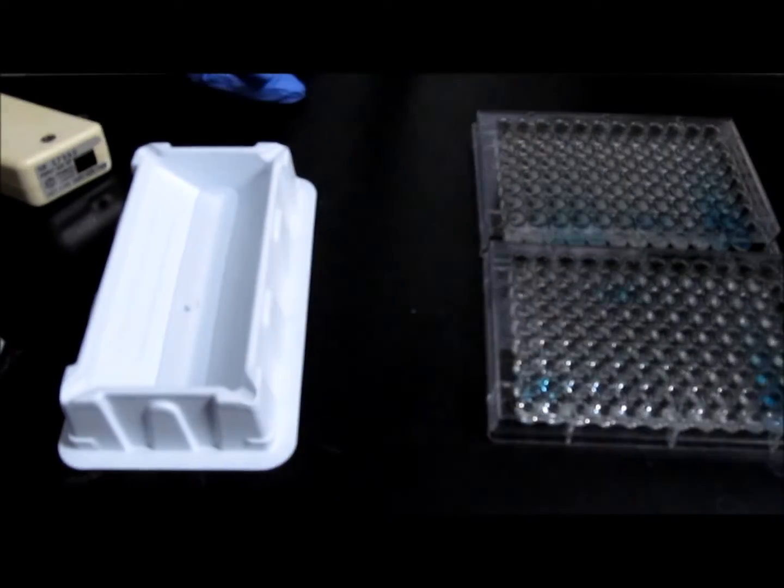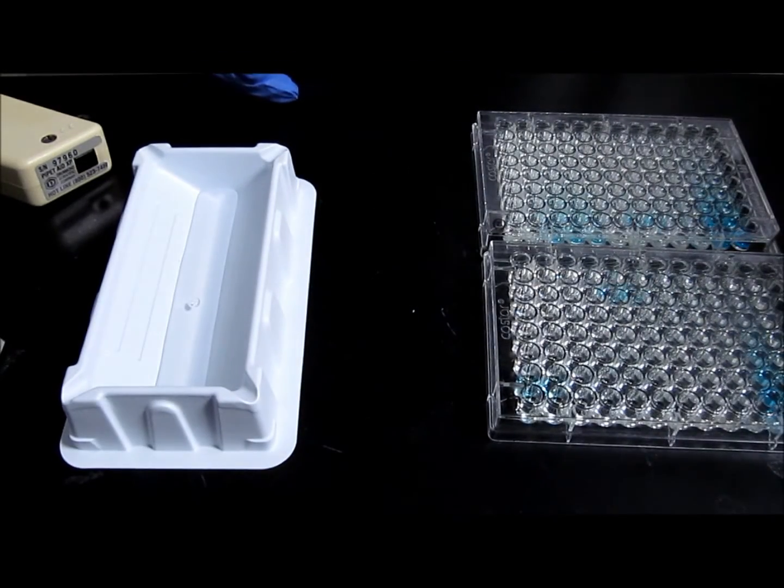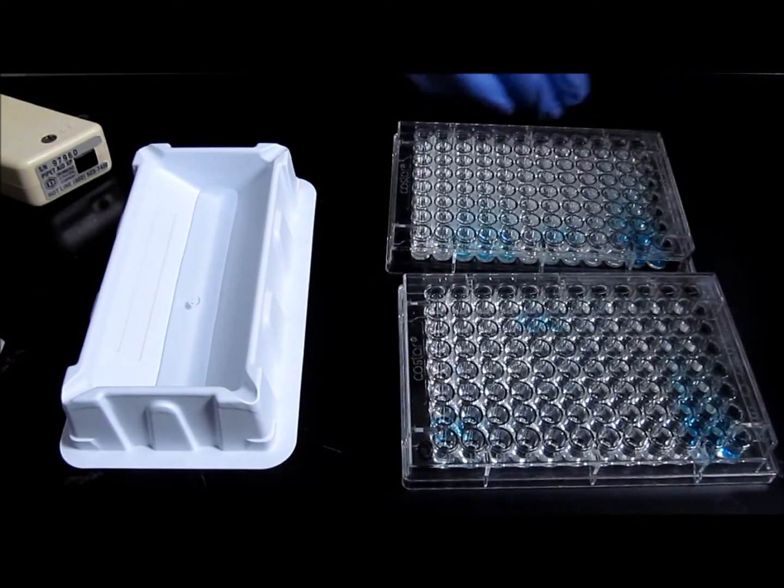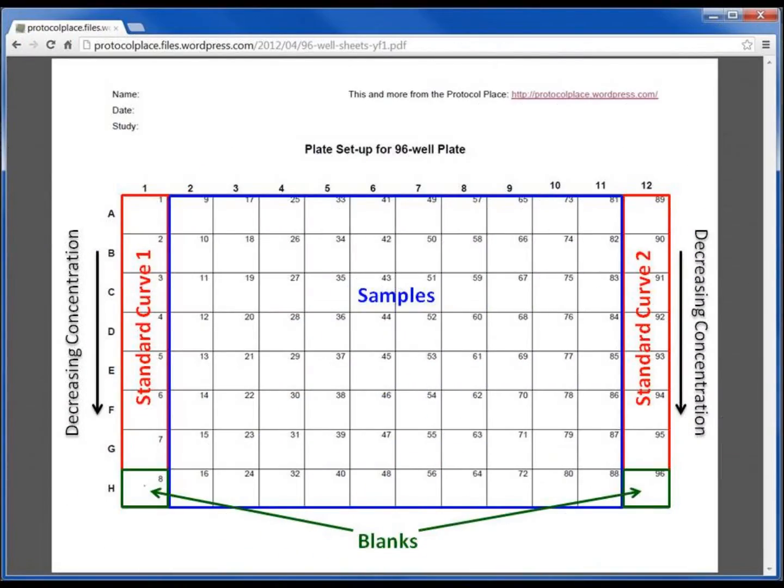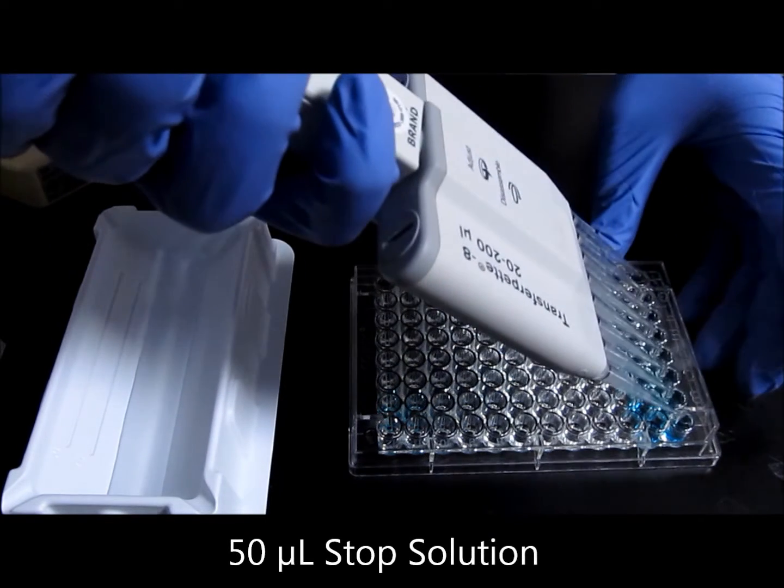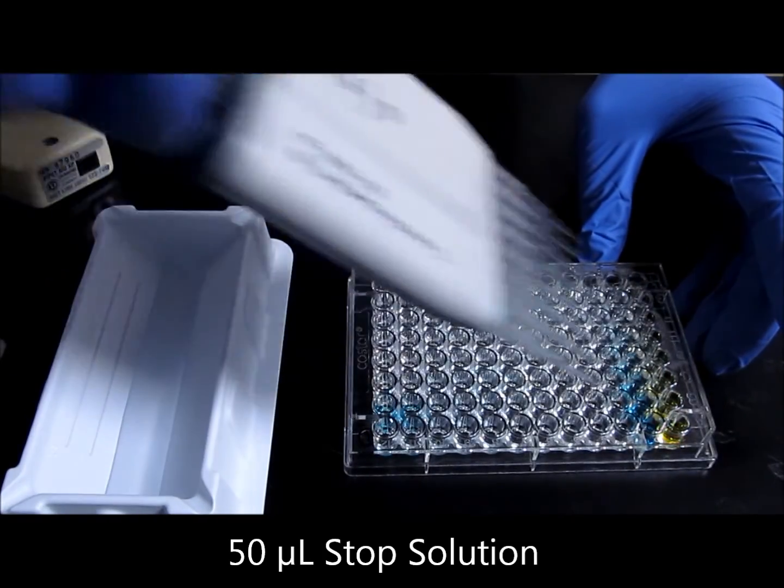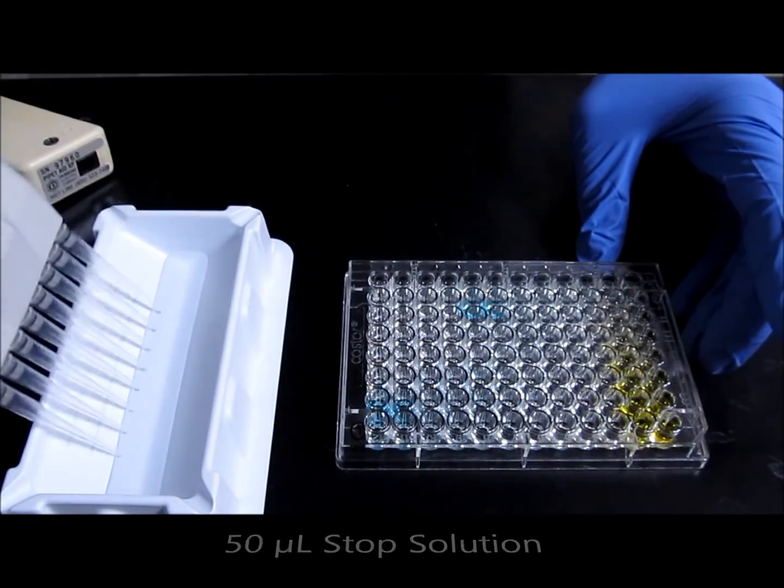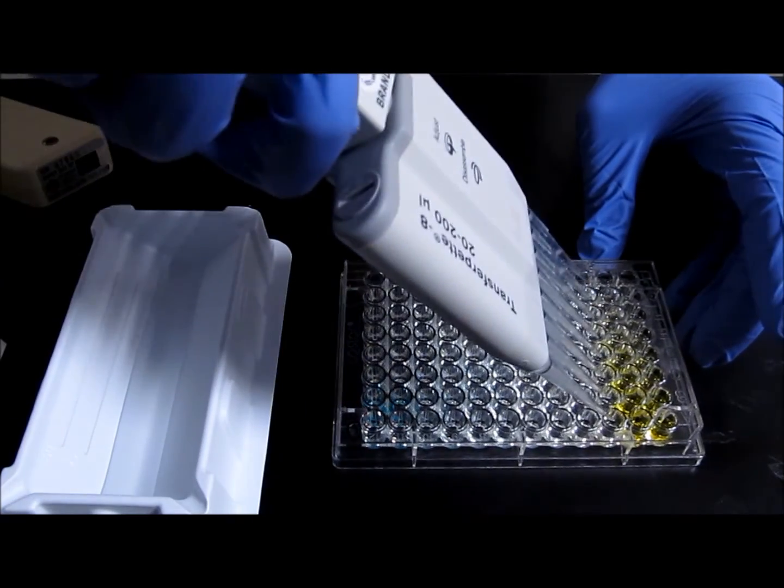The sample should be turning blue at a rate which reflects the amount of protein of interest. If you have prepared a standard curve, the best time to stop the reaction with stop solution is when the most diluted sample in your standard curve has produced a little bit of blue color. When the plate is ready, add 50 microliters of stop solution to each well of the ELISA plate. The blue color should immediately change to yellow as shown here.